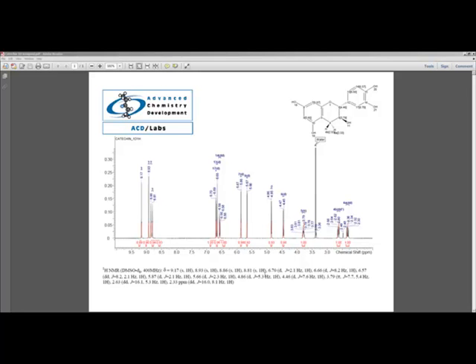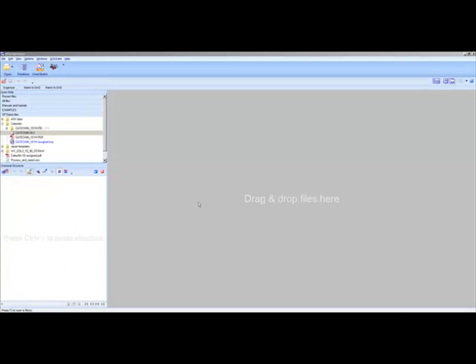As you can see, the peaks have been properly integrated, a chemical structure with corresponding chemical shifts is attached, and even the multiplet report is complete, ready at a moment's notice to copy and paste into a patent application or publication. I would like to show you how easy it can be to prepare standardized reports like this one at the time of processing, without any extra effort on the user's part.